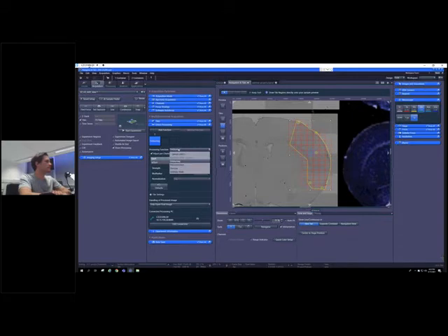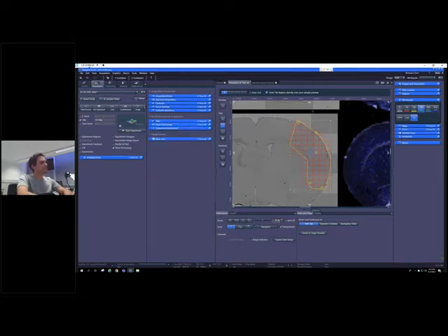Besides deblurring, of course, the direct processing module also allows you to use other processing functionalities. For example, if you have an apotome in use, you can do the apotome raw convert. You can use some deconvolution settings to be run online, as well as denoising and unsharp masking. By the way, if you are operating an Airyscan equipped microscope, you can also use the Airyscan processing function as a direct processing option.